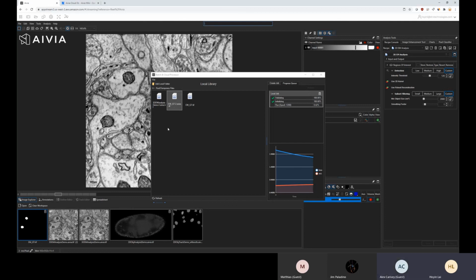No, I don't deconvolve the STED, well, not for this specific purpose. Okay. Yeah. So I think that.